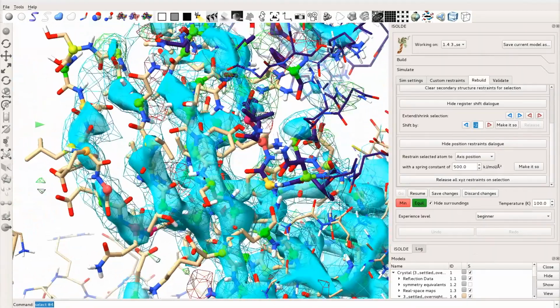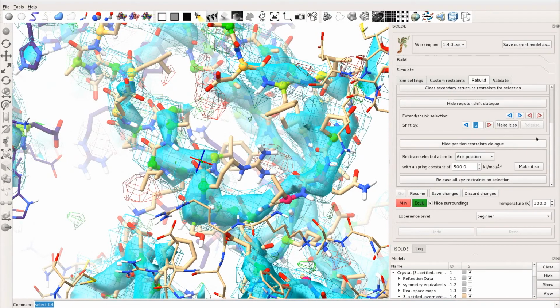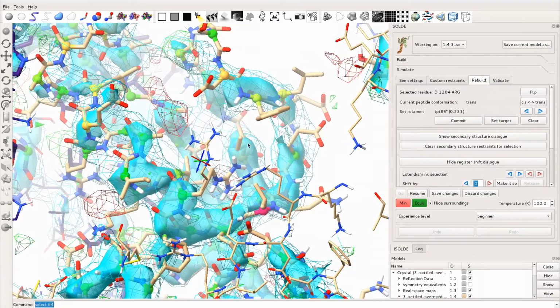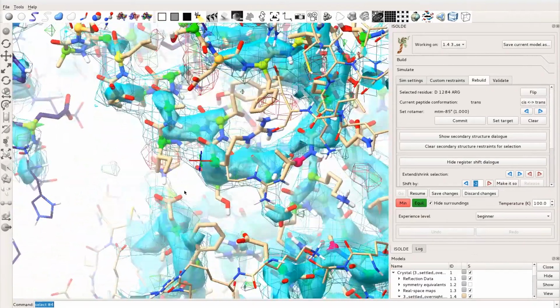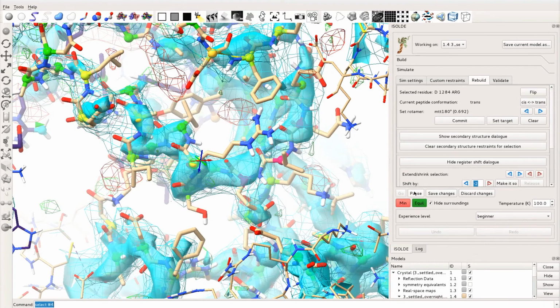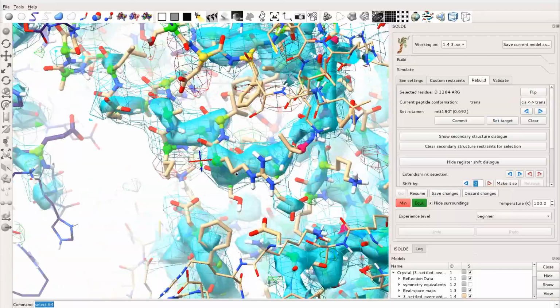This arginine residue has not quite managed to extend out into open space after the register shift, and is blocking the adjacent valine sidechain, creating a Ramachandran outlier. This could probably be solved with a simple quick tug using the mouse, but here we may as well dial up a suitable rotamer. Scrolling through the list of alternatives, we see the one with the second highest prevalence looks like it will make a nice salt bridge, so let's put it there. Setting the coordinates there directly would cause a clash, but setting it as a target allows both arginine and acid to settle together. After that, resolving the valine Ramachandran outlier is a simple peptide bond flip achieved in much the same way as the cis-trans flip I demonstrated earlier.